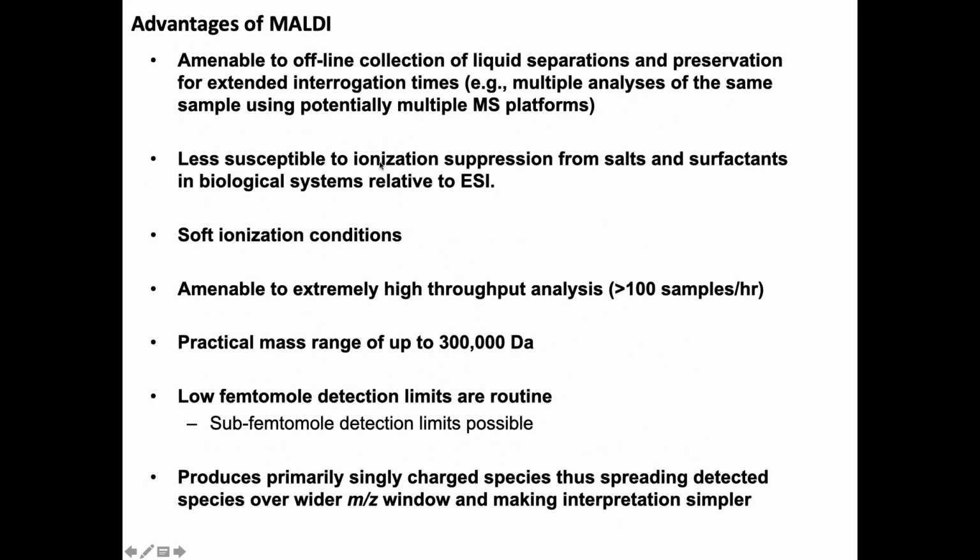A nice thing is it's less susceptible to ionization suppression, so we'll talk about electrospray, which really allows you to directly couple HPLC to your mass spec. In MALDI, you don't have to worry so much about, do I have 10 or 100 millimolar sodium chloride, okay? That is not as big of an issue in MALDI, all right? In electrospray, it's a big issue. Still soft, but again, like I said, there are some concerns about popping off some of the labile groups.